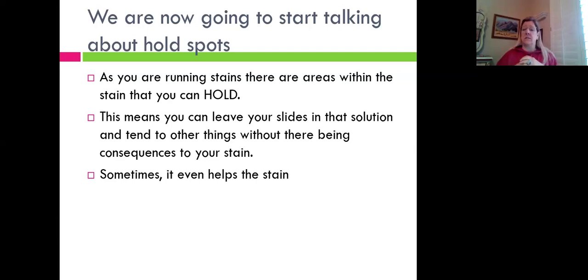In some instances, it also helps the stain, especially when we're talking about developing a stain, bringing that color up into a brighter color. By holding in that particular spot, it actually brightens up your stain for you.